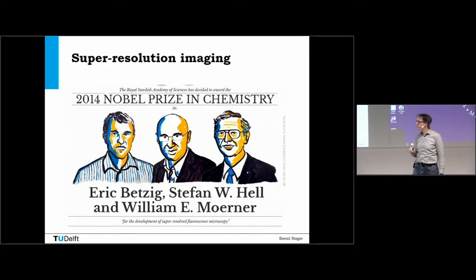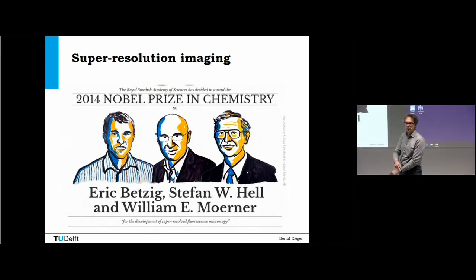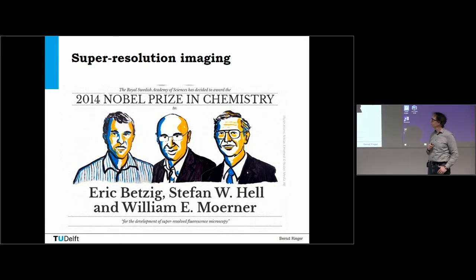So now I'll show you a few of the technical advances in the field that have made that happen. One is super resolution imaging at the smallest scale, the Nobel Prize a few years back, that made that possible. So now the field is maybe 13 years old, and that really made a big impact in that a lot of people acquire new images. You will see that back.